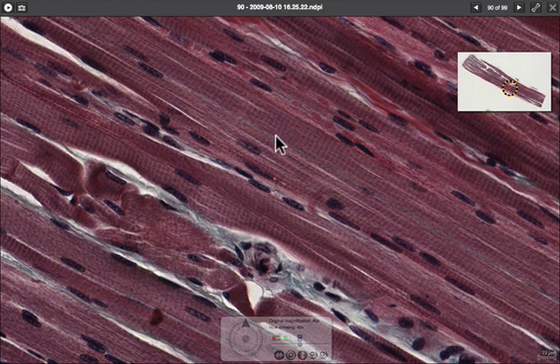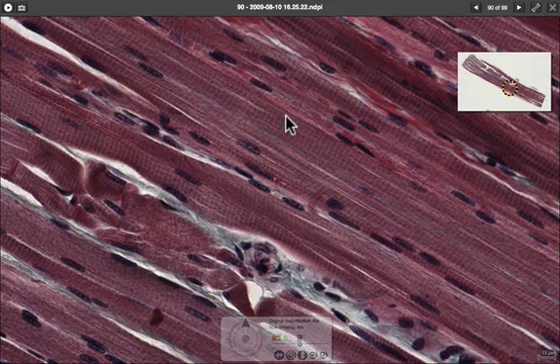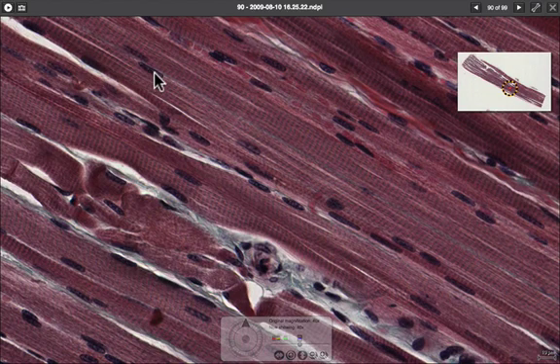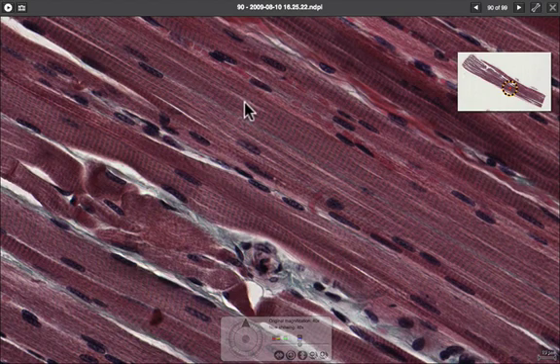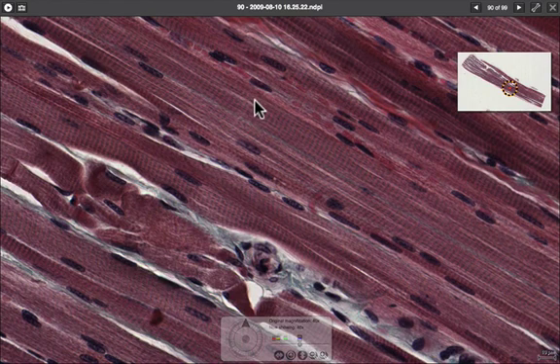To distinguish skeletal muscle from other muscle types: it has striations, the muscle fibers have peripheral and often multiple nuclei, and the fibers themselves are not branched at all — they're all very straight, so that when they contract they pull the muscle in one direction.